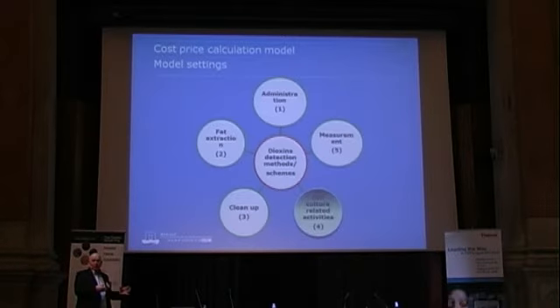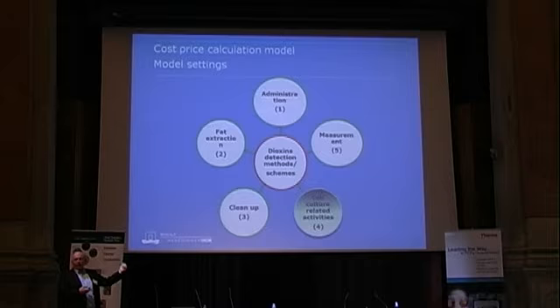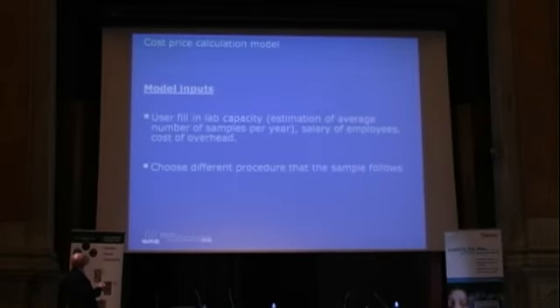You have to fill in, of course, the lab capacity. Because everybody knows if you buy an expensive instrument from Thermo, a DFS, and you do only one sample on a yearly basis, this sample will be very, very expensive. But you have to fill in the lab capacity, estimated average number of samples, salary of the employees, and so on.